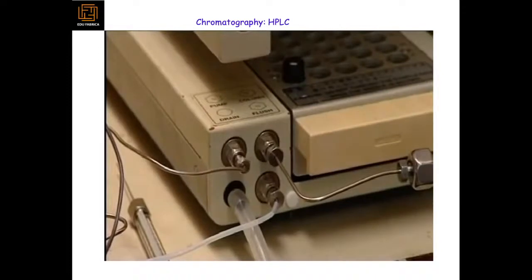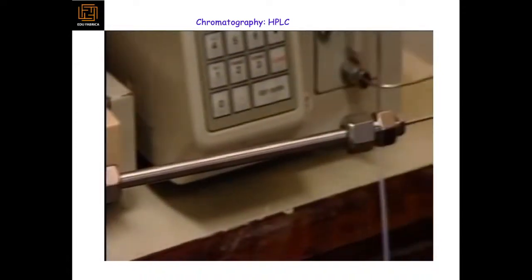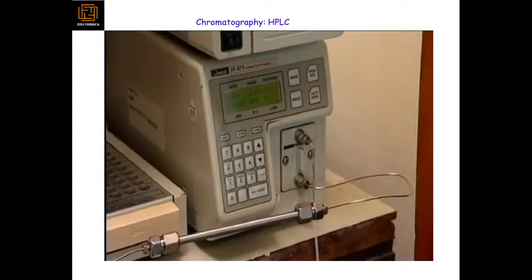The pumps force the mixed solvents through the column. The solvent emerging from the column and carrying the separated components of the mixture passes into the detector. Here, a beam of ultraviolet light shines through it. This light is set at a wavelength that is absorbed by all the components to be separated.